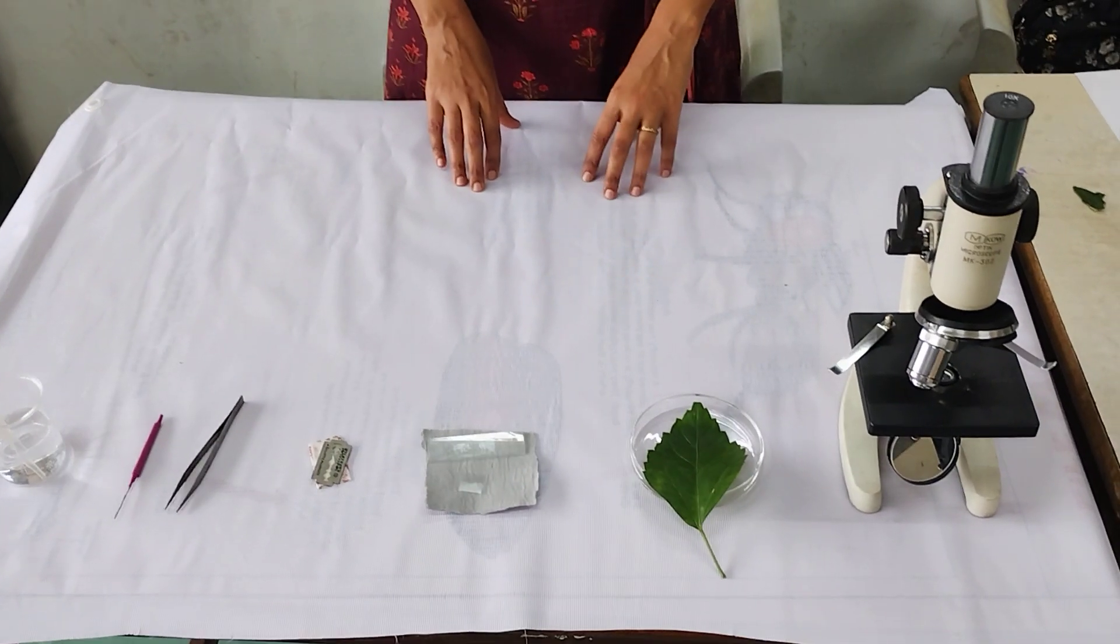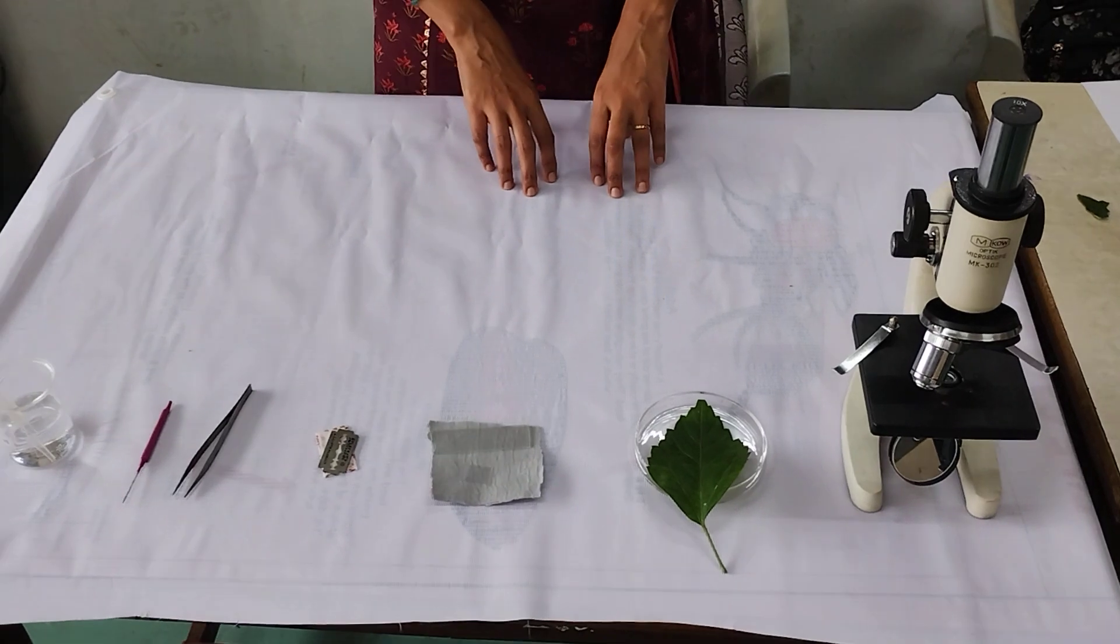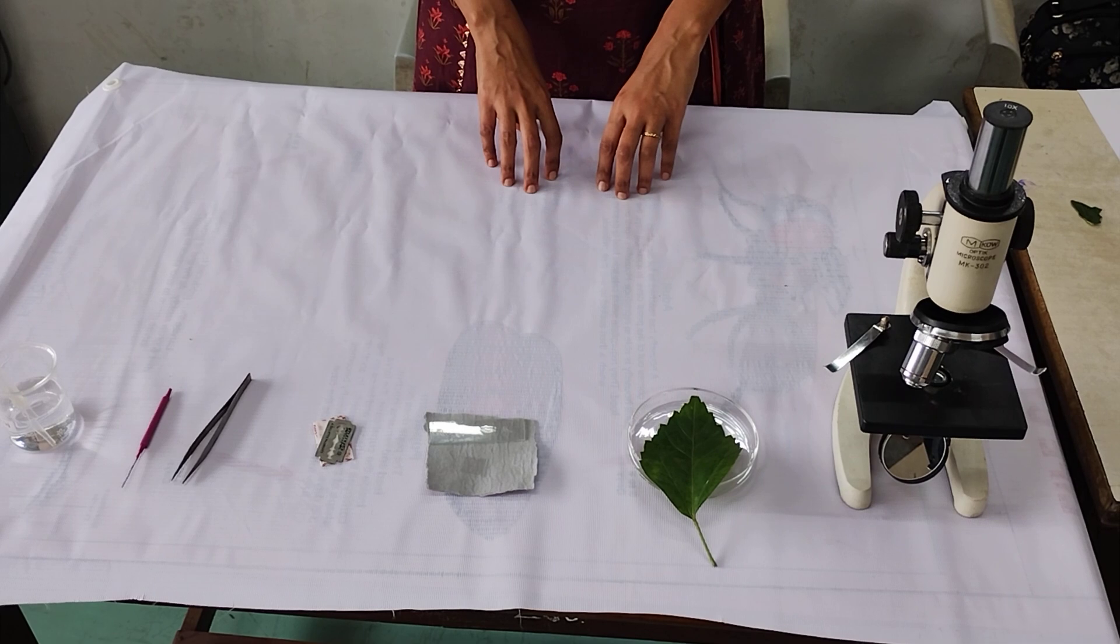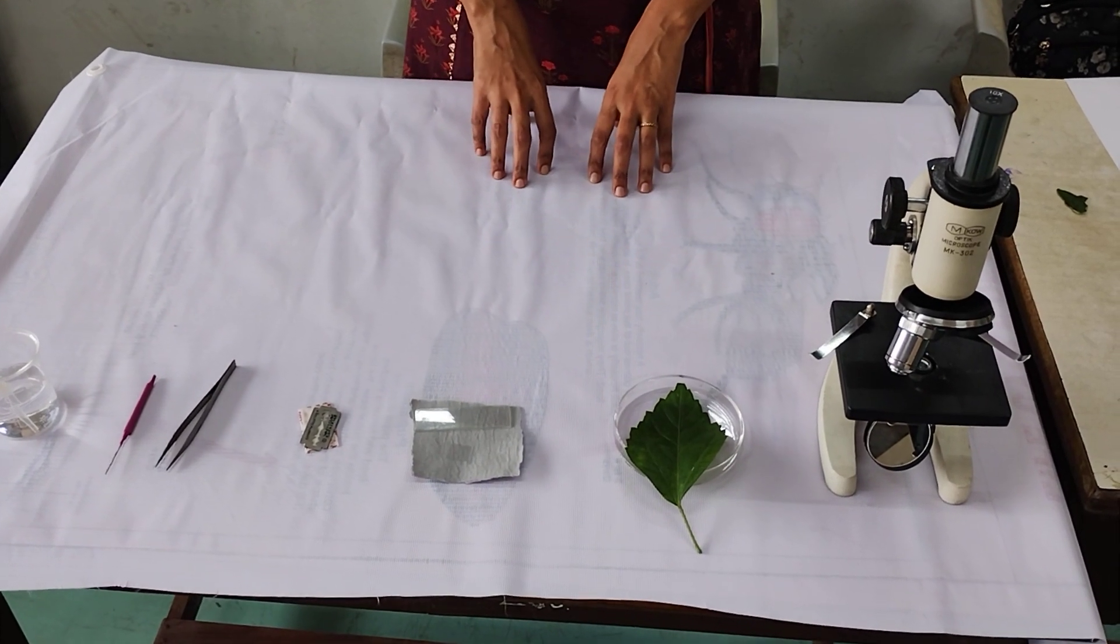CBSE board practicals, subject biology, question number 1: to study the structure and distribution of stomata in upper and lower epidermis of the dichot leaf.